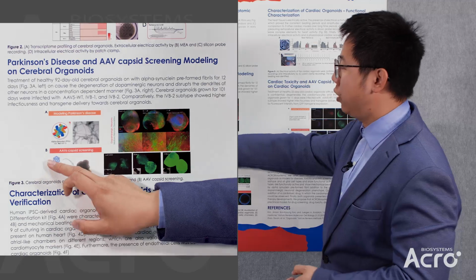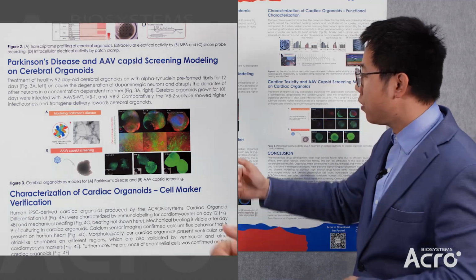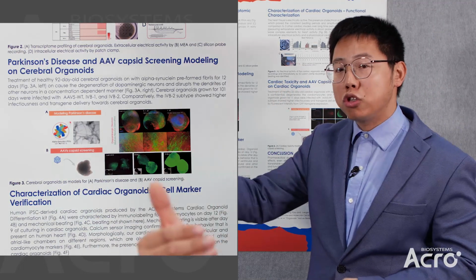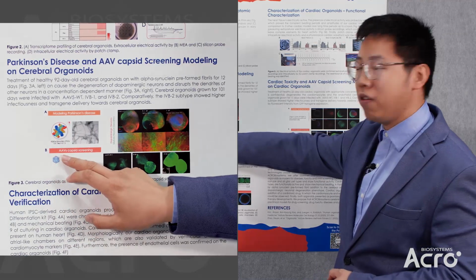Additionally, once we have the disease model, we want to develop drugs to combat the disease. Here, gene therapy is becoming the most popular therapeutic strategy. And here we have the AAV screening.